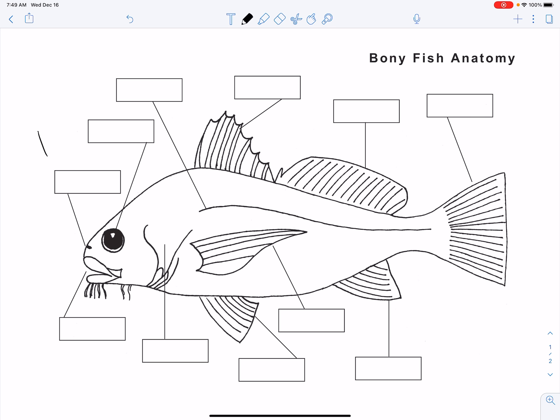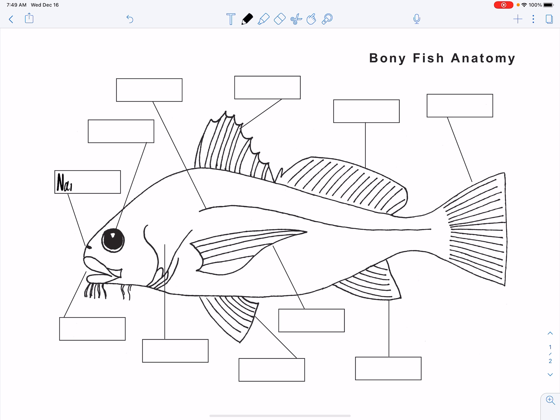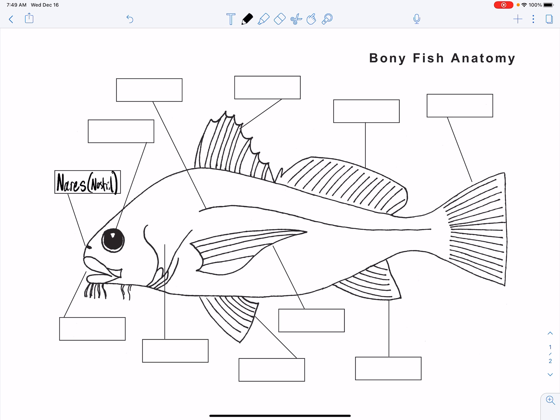Starting with some easy ones: most people would call that structure on our fish the nostril, and you certainly can. But the official biological term is the nares — that's Latin for nostril. If you want to impress your friends, you can refer to your nostrils as nares and they'll have no idea what you're talking about. So there we have the nares on our fish.